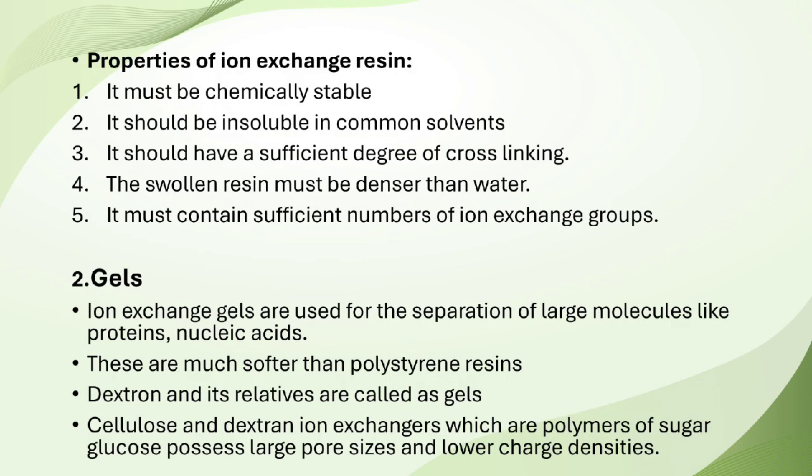Properties of ion exchange resin. It must be chemically stable. It should be insoluble in common solvents. It should have a sufficient degree of cross-linking and the swollen resin must be denser than water. Also, it must contain a sufficient number of ion exchange groups.